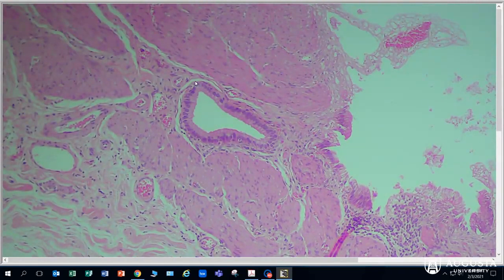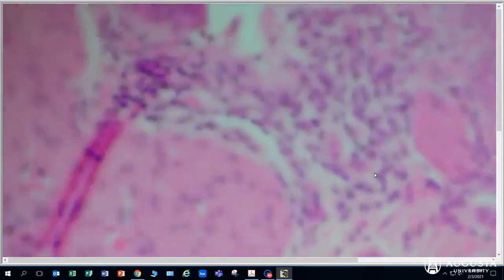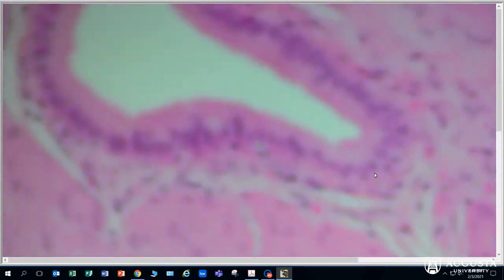So here we see a ring of epithelial tissue. We've got lots of basement membrane and connective tissue underneath, but this is the lumen, or the open space, right here. We can see that kind of rough fragmented edge on our imperfect slide. If we move from the 10x objective to the 40x objective, we lost it a little bit. Let's see if we can find that structure right here. There we go.